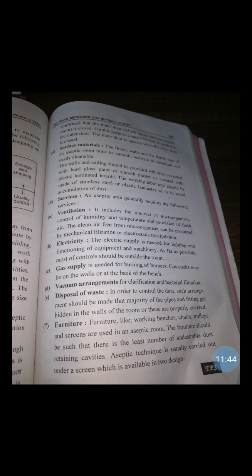Then the plastic screens are transparent and hence give good visibility of the contents. Moreover, they are light in weight and can be moved from one place to another without any difficulty. Then the screen is a box-like structure with a glass sloping front.